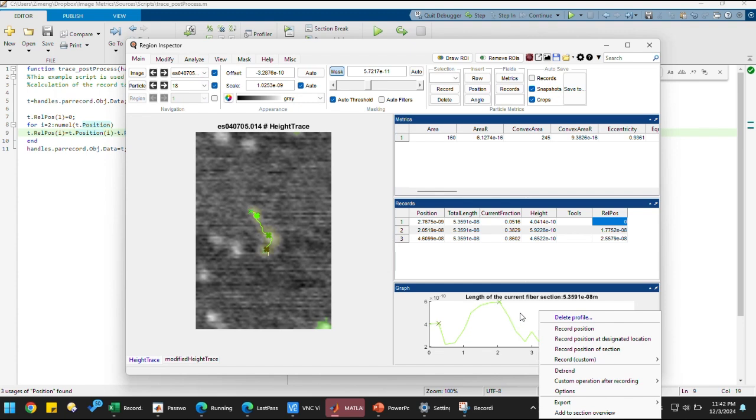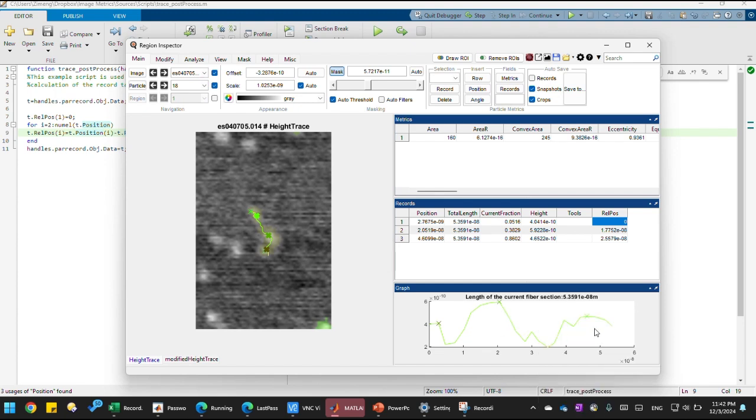So once you finish recording, let's say you apply 2 profiles. Once you finish recording, it adds 2 columns, right? One profile adds one metric and the other profile adds another metric. So it adds another column. In that way, you can automate the calculation of additional metrics by using multiple profiles.